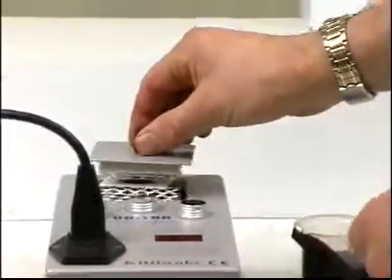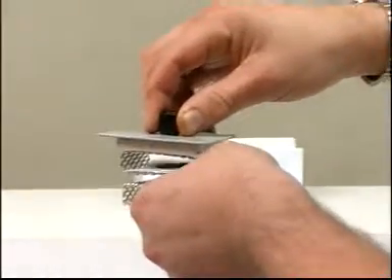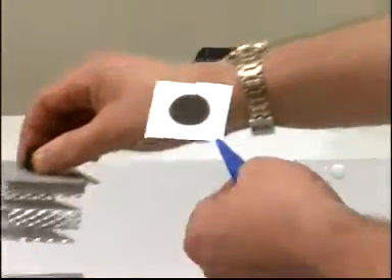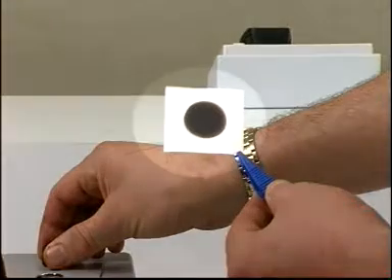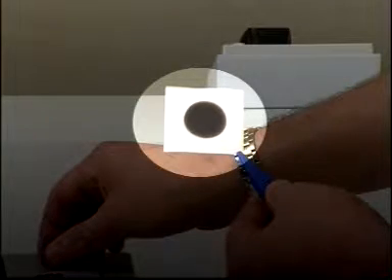Remove the paper and compare it against the spot rating chart in your user manual. Ignore all other characteristics of the spot except the center ring. Any rating other than one means that the oil is likely to deposit sludge to some extent.